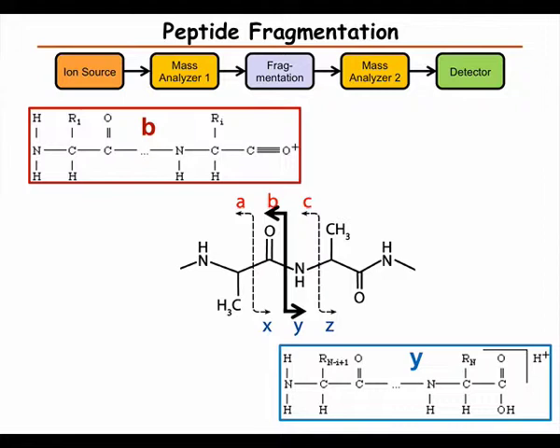For example, at prolines we usually get a very large fragment peak. But also for the other amino acids, you see big differences. It's because the energy goes to the weakest bonds, which fall apart.